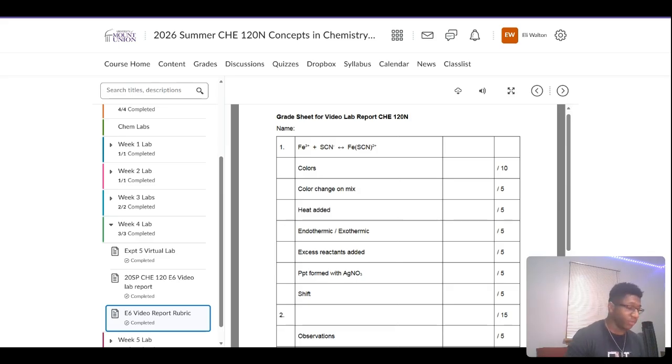When adding reactants, the equilibrium shifts to the right, and more of the FeSCN2+ forms, which makes the deep bloodish red color come back. And then when you add the AgNO3 solution, it creates more of a silver nitrate, whitish color, and it reacts by attacking the thiocyanate ions. Removing SCN- causes the equilibrium to shift back to the left, which makes the red color fade, since the FeSCN2+ breaks down and removes the SCN-.